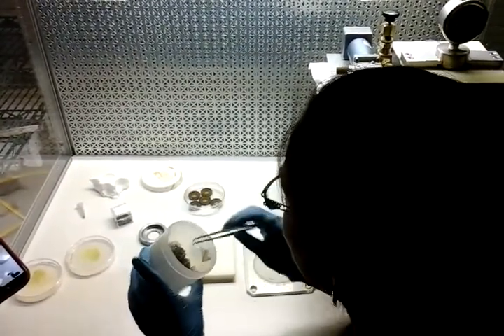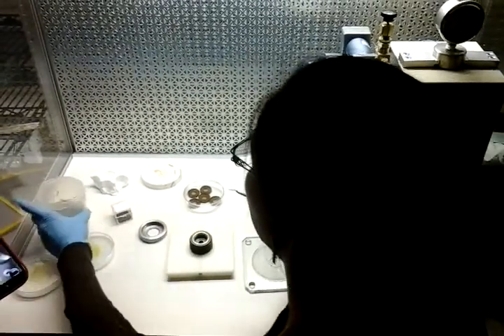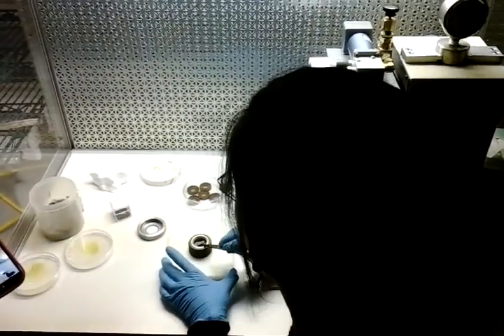This is what we're going to use to catch our disc. It's a mesh. It's not very wide.